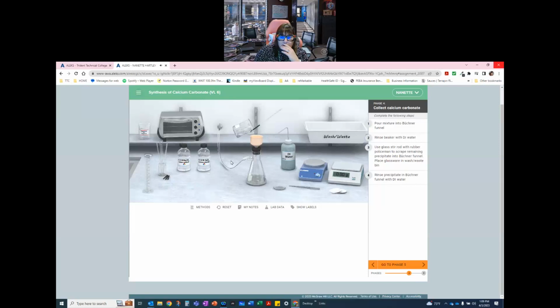Pick up one of these, and we'll try and get all of it out. It is very important to try and get all of it out. That is kind of a pain in the neck. And put that there. And then we rinse that again. And put that there.